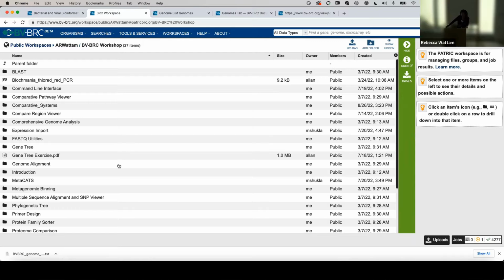Taxonomic classification is going to tell you how good a job you did in isolating that DNA and if you cleaned it up well. Fastq Utilities is going to tell you how good a job that sequencing center did with your isolates. Generally, I always start by questioning other people and not myself. So I want to see how good my reads are before I accept any of the blame for what is about to befall me.